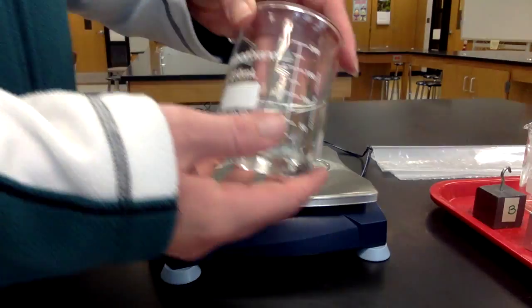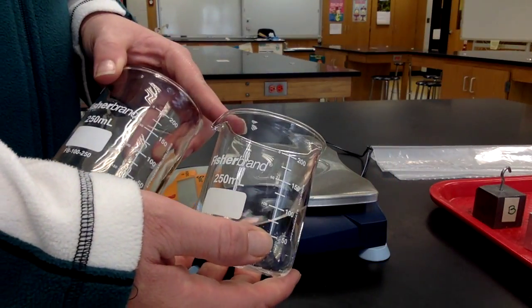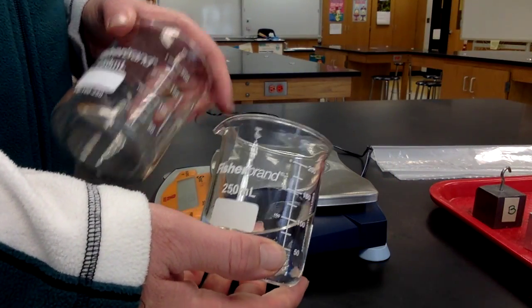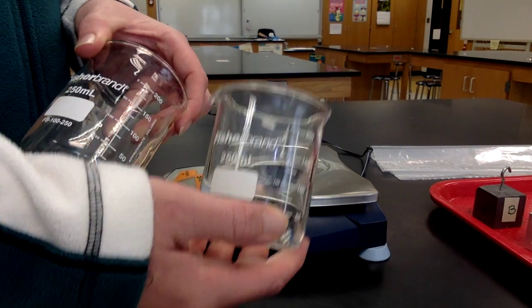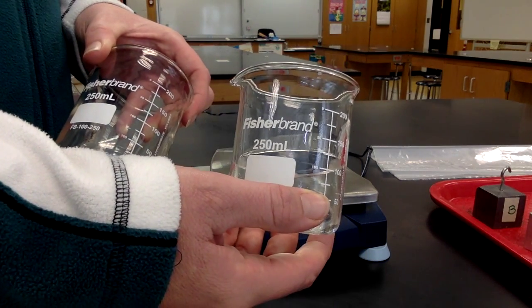To calculate the mass of the liquid only, you will subtract the mass of the container from the mass of the container with the water.